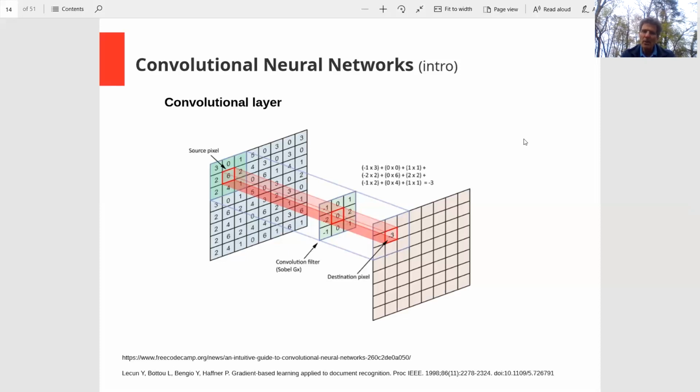These techniques have been developed a lot also. But the point I'll make is that by posing the X-ray diffraction phase problem as an image in, image out, it means that we can look to some of these other techniques that have been used on high resolution images and say, well, maybe we can use that technique for this problem as well. And that's what I've done, is use convolutional neural networks for this problem.